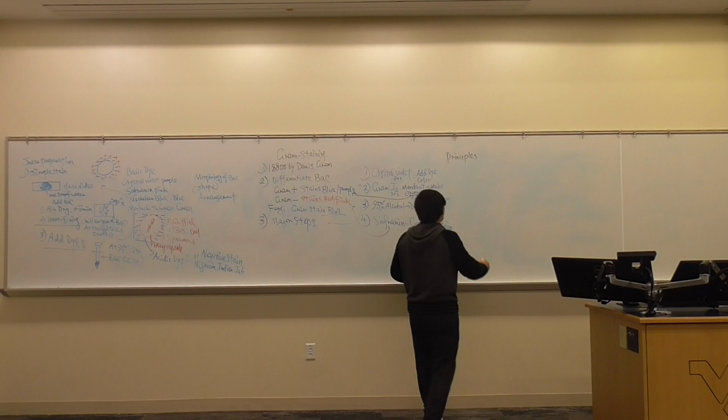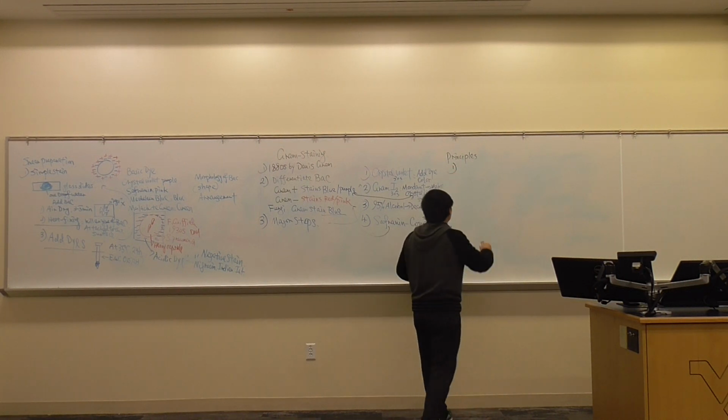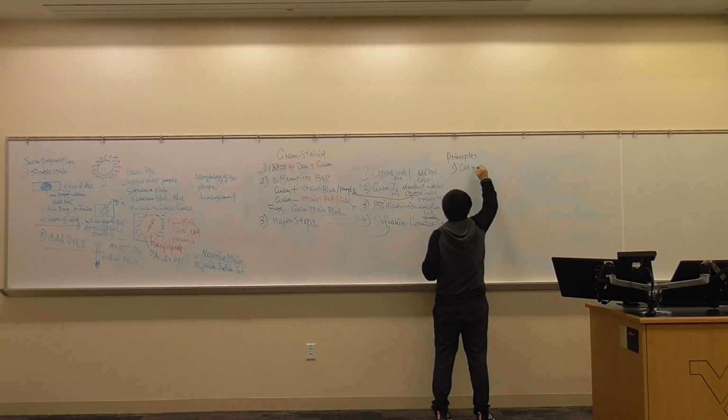So what are the principles? Basically, there are two theories about it. Number one, cell wall theory.